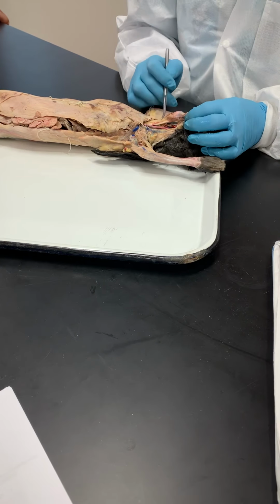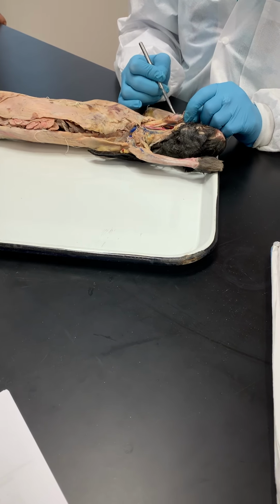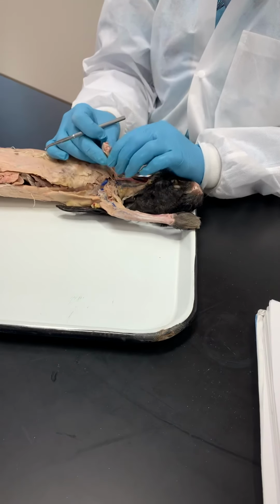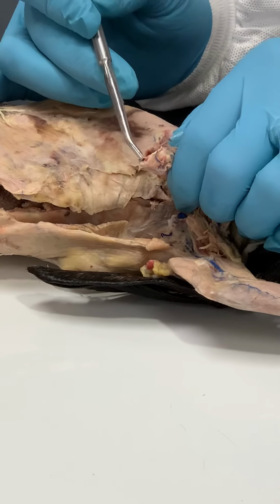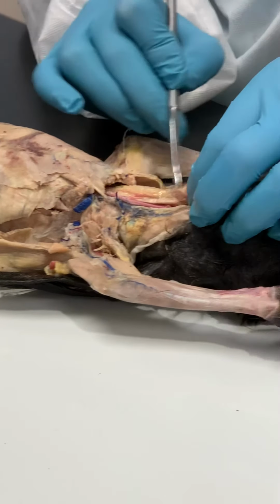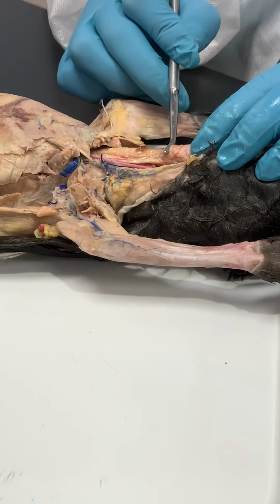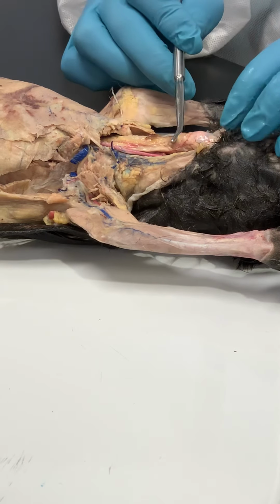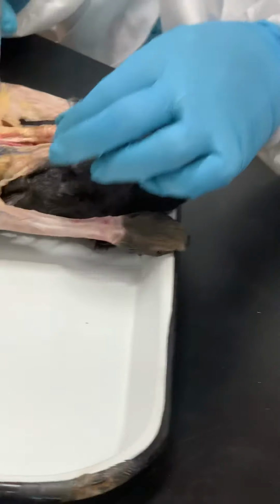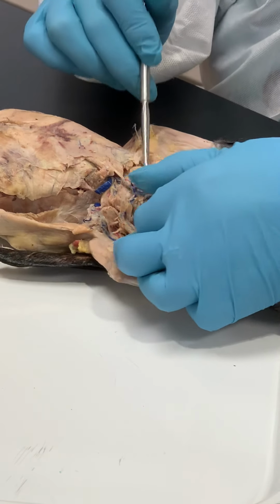So here's your trachea, here's the larynx. This is the thyroid cartilage right here, a shield. Up top, do you see the flap, the epiglottis, right there? Okay, and then down here, you can see the transition, right, from here to here. This is where the cricoid cartilage will be, okay? Then you have your trachea with your C rings.